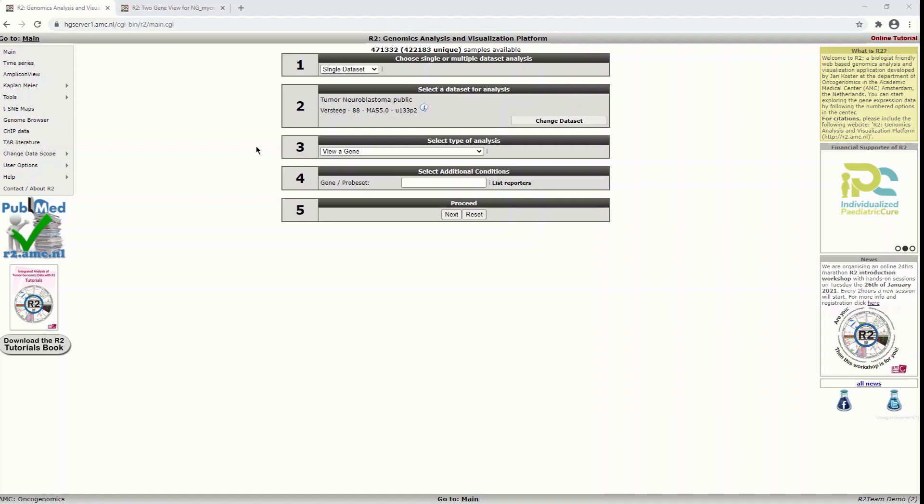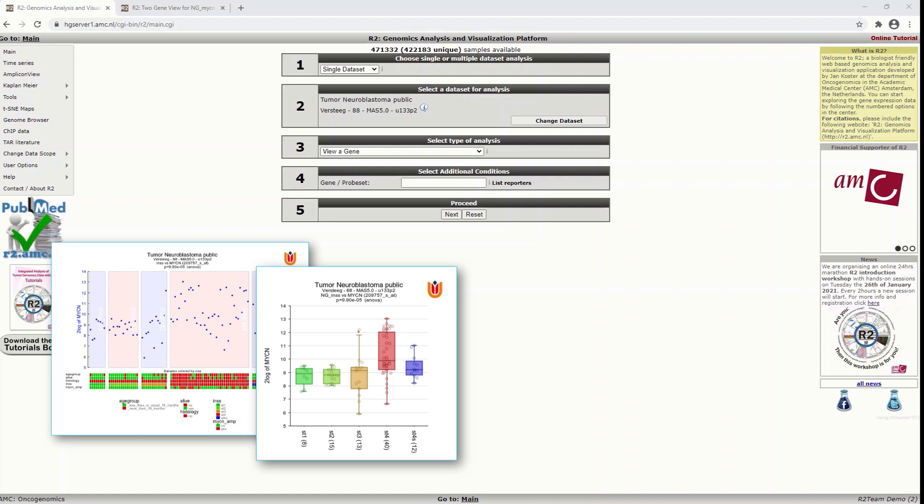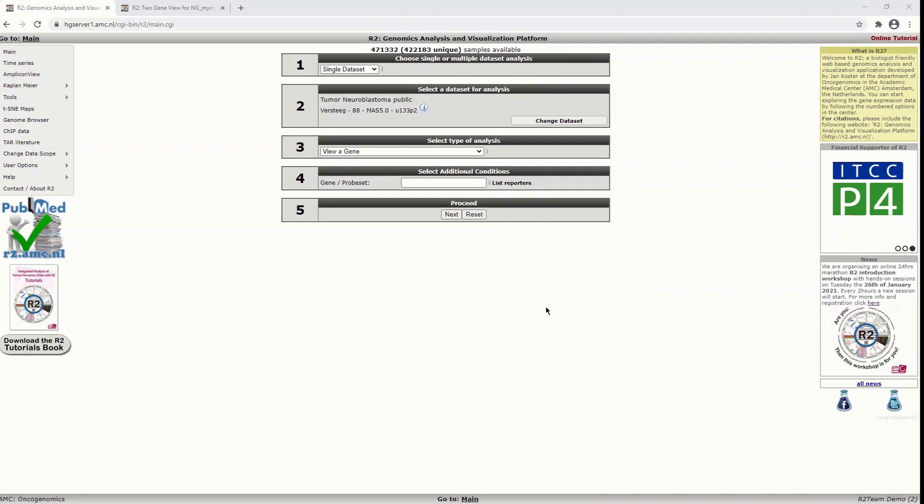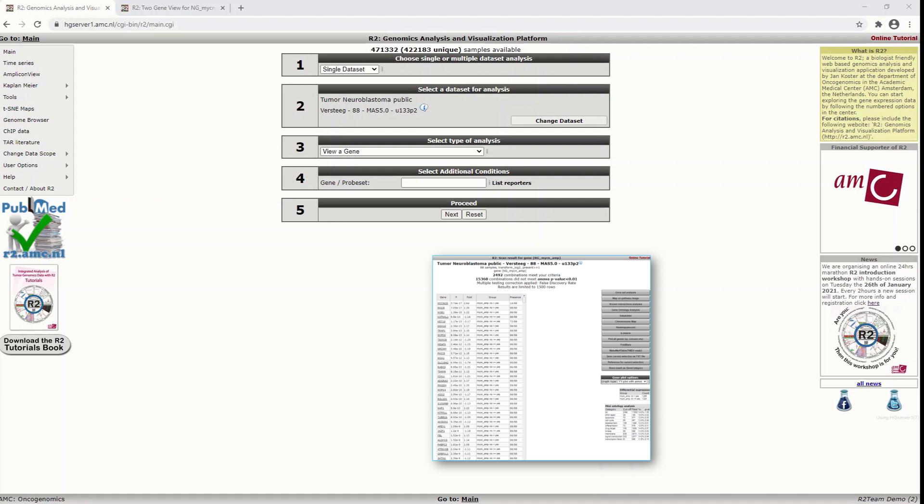The first module is view a gene in groups, with which you can look at the expression patterns of one gene and that allows you to split up the samples in groups based on a track. The other module is called differential expression between groups. It finds the most significant differentially expressed genes between groups.